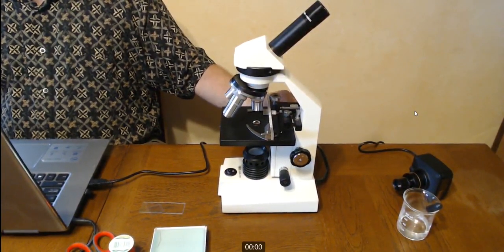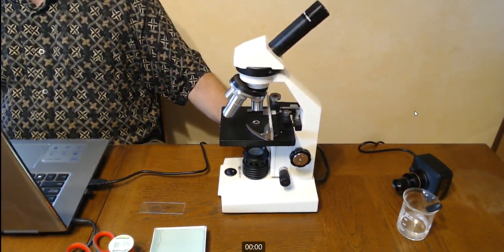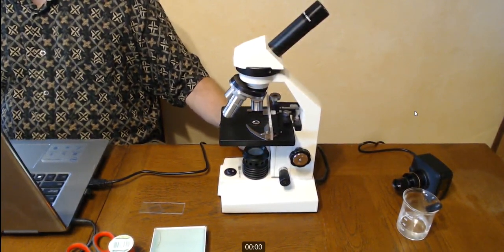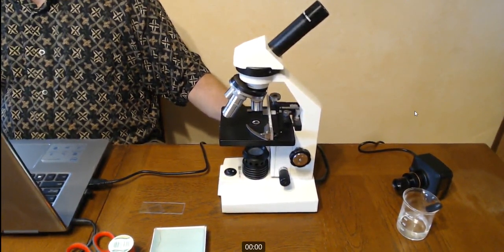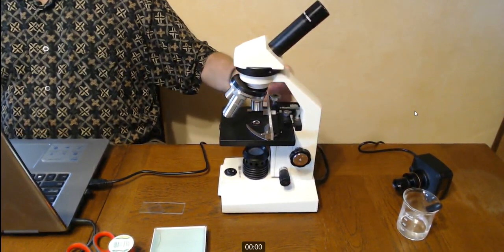Notice how much it turns. Now if I use a small knob underneath, the fine adjustment, you can barely or maybe not even see it move as I twist that knob. If I twist it a lot, then I shake everything, so that's not a good thing to do. So, coarse adjustment, fine adjustment.